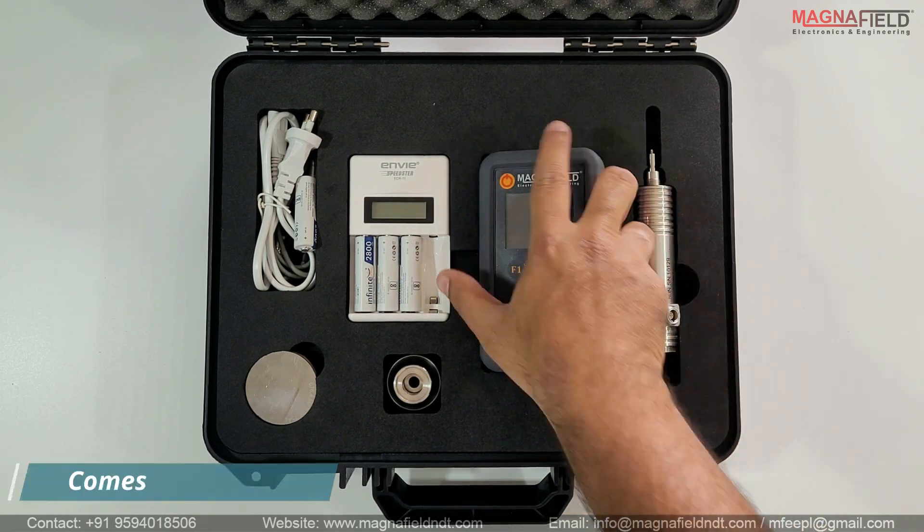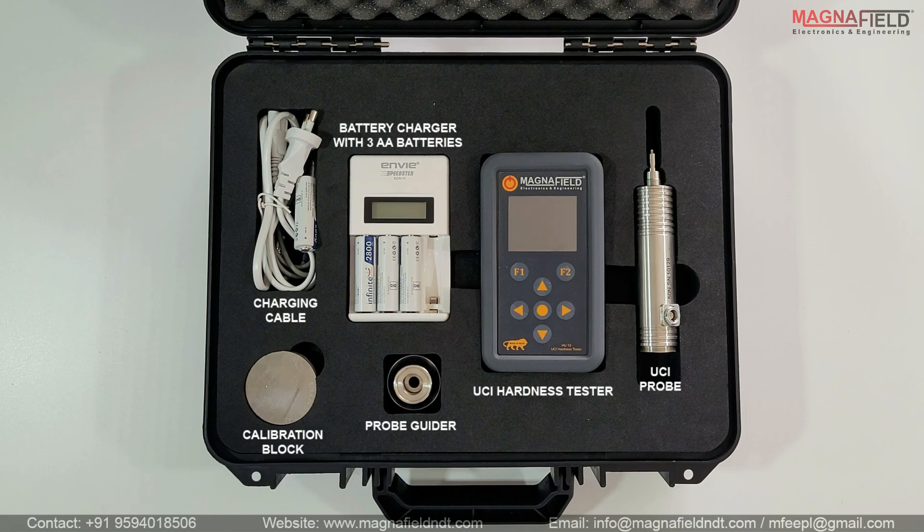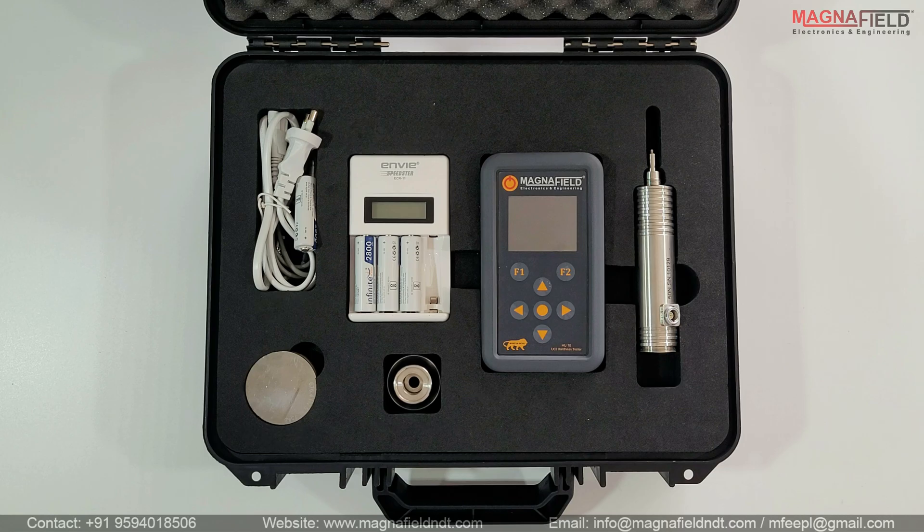It comes with a sturdy rugged box. The box contains the UCI Hardness Tester, UCI Diamond Indenter Probe, calibration block, probe guider, battery charger with three AA batteries, and a charging and probe cable.